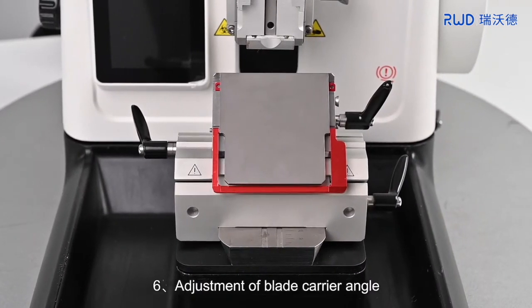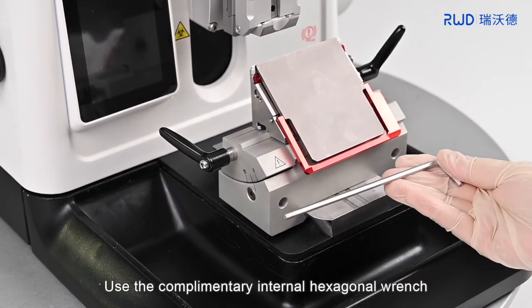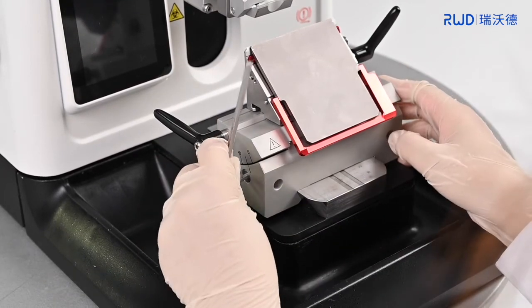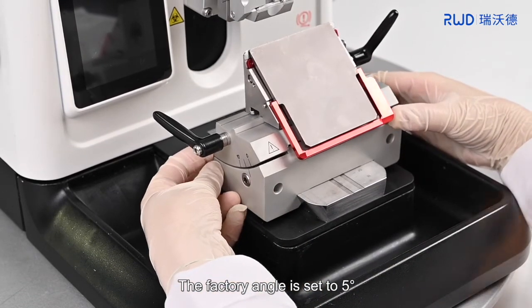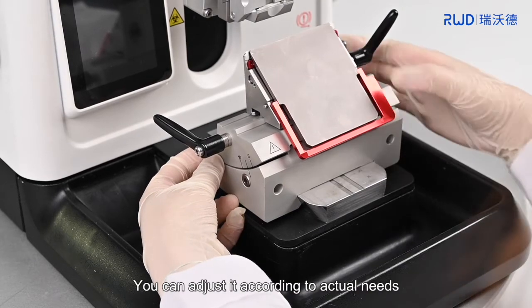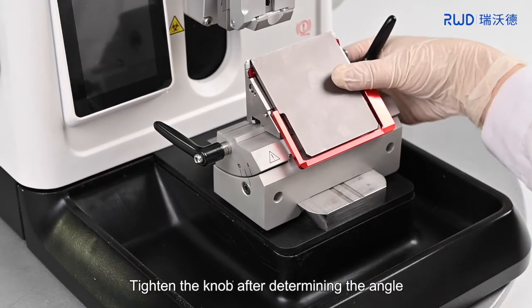6. Adjustment of blade carrier angle. Use the complementary internal hexagonal wrench to loosen the hexagon socket head cap screw and adjust the angle of the blade carrier. The factory angle is set to 5 degrees. You can adjust it according to the actual needs. Tighten the knob after determining the angle.